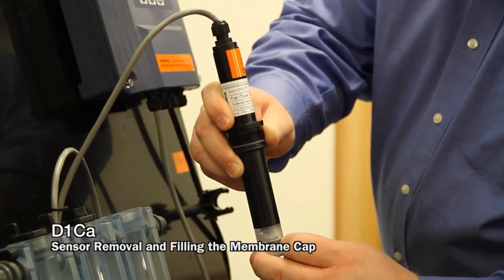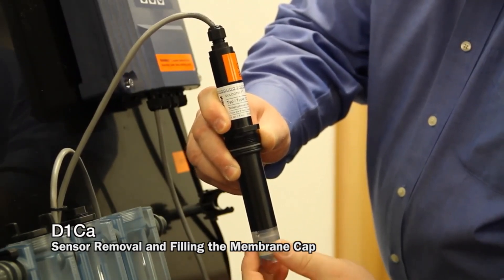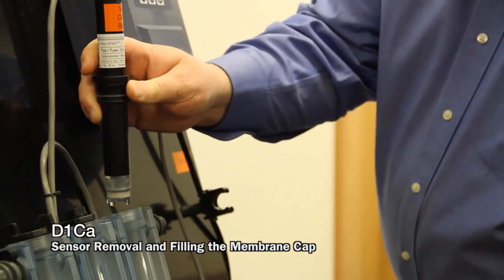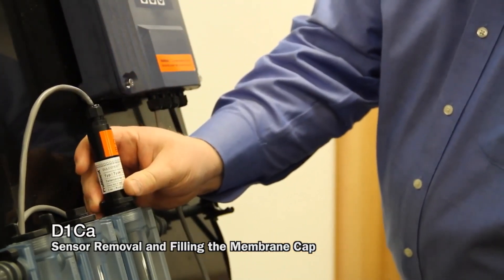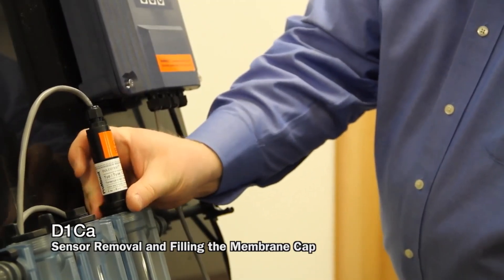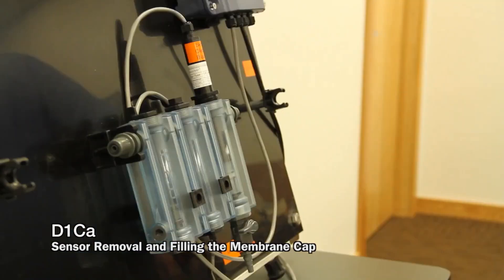Thread the cap back onto the sensor. Place the sensor back into its sample cell and tighten the compression fitting back in place. You can now start flow in the sample line.